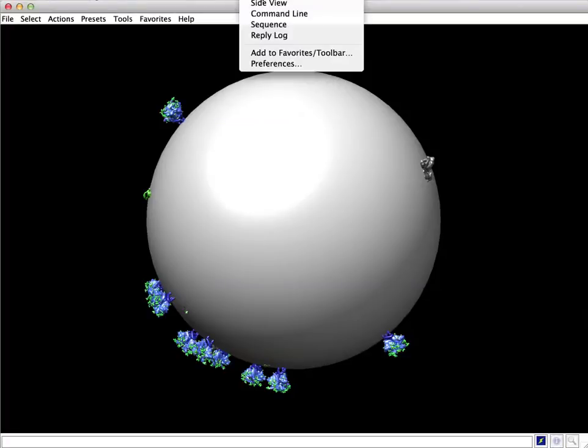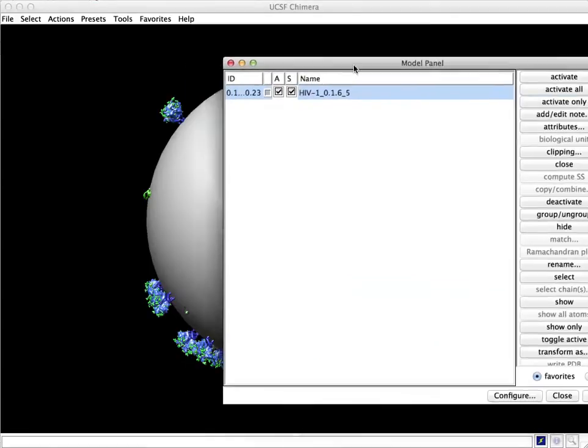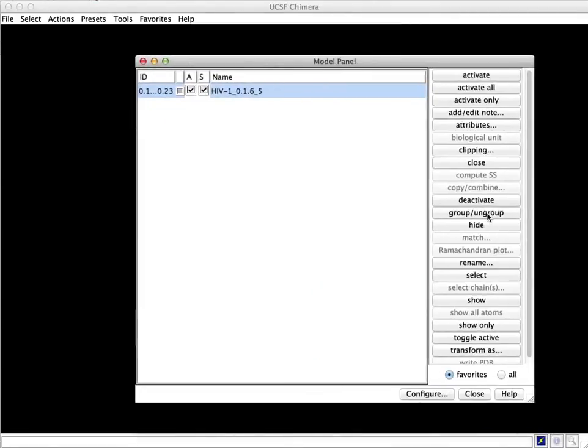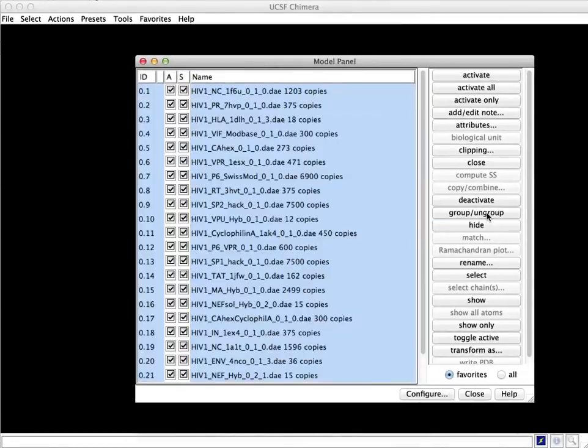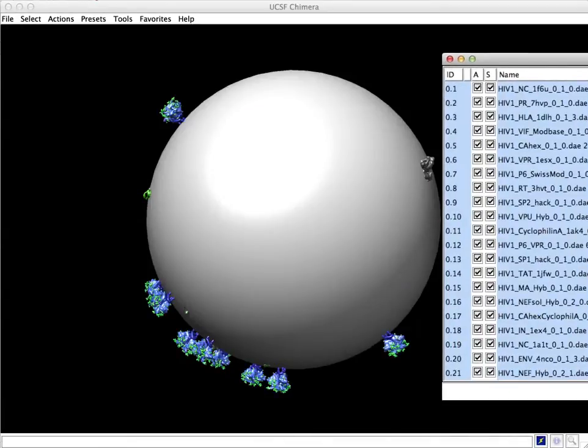Then I recommend you go to the Modeling panel, select this whole unit, and click Ungroup to see all of the components that comprise it.